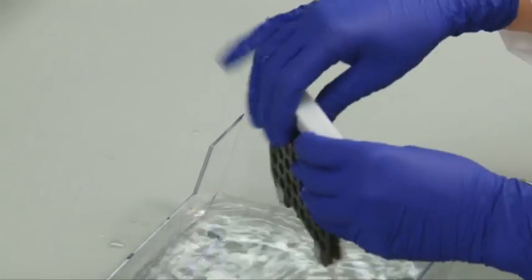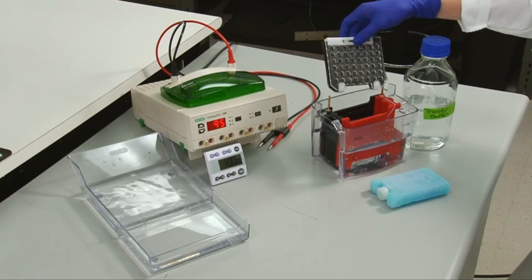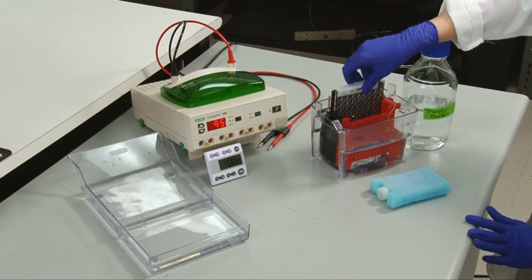Lock the cassette and place it in the transfer apparatus containing cold transfer buffer, ensuring that the cassette is properly positioned from negative to positive.